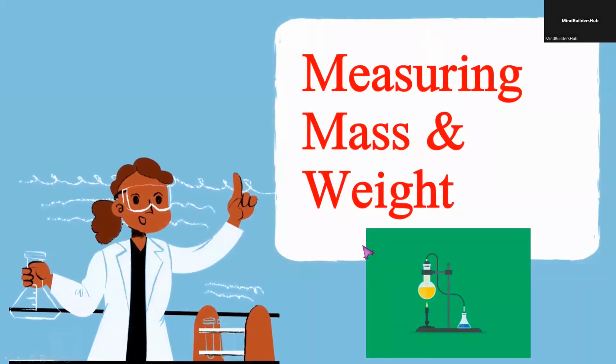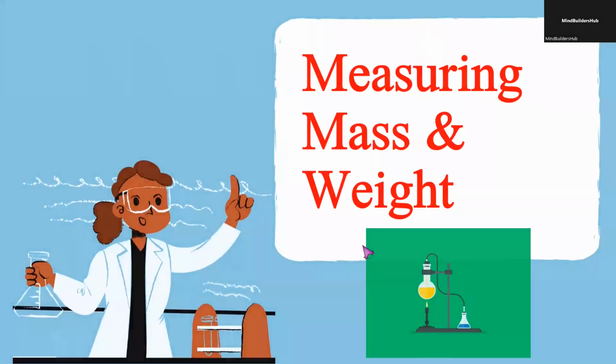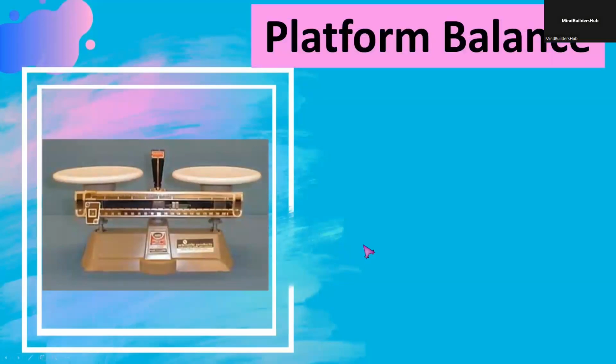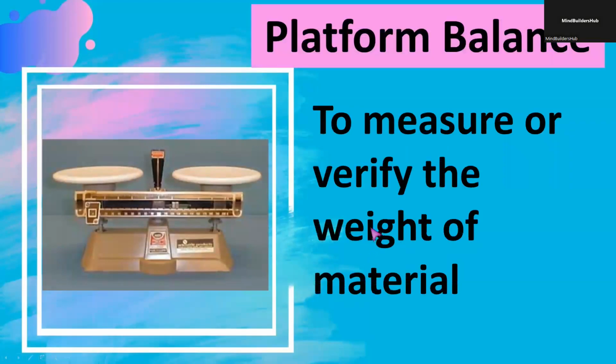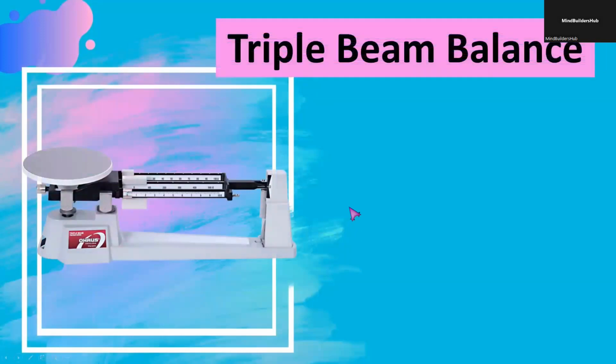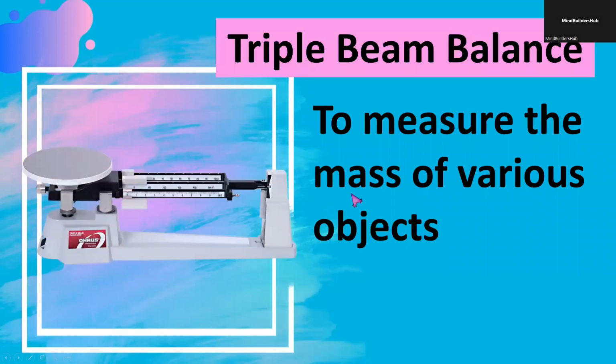What about the instrument or apparatus used for measuring mass and weight? We have the platform balance to measure or verify the weight of the materials. If you want to compare the weight of two materials, you may use the platform balance. Another is the triple beam balance, used to measure the mass of various objects.